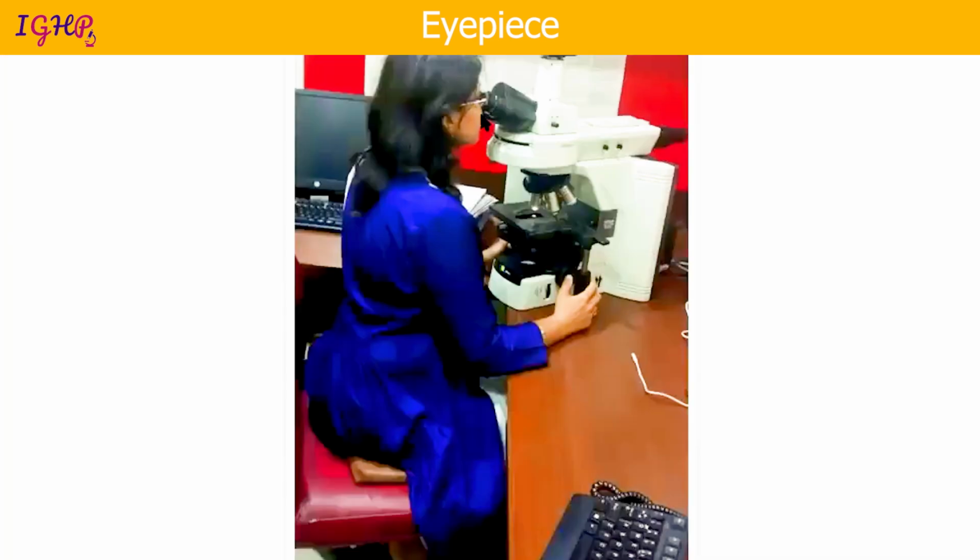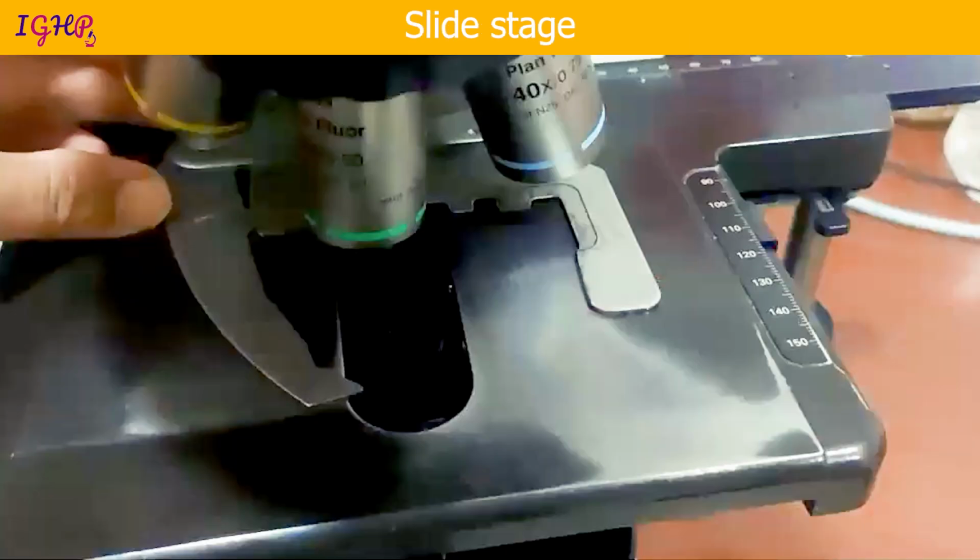And once you have adjusted the eyepiece, then you look into the eyepiece with your glasses on. So you need not remove your eyeglasses when you look into the microscope. Your glasses should be on when you go into it.